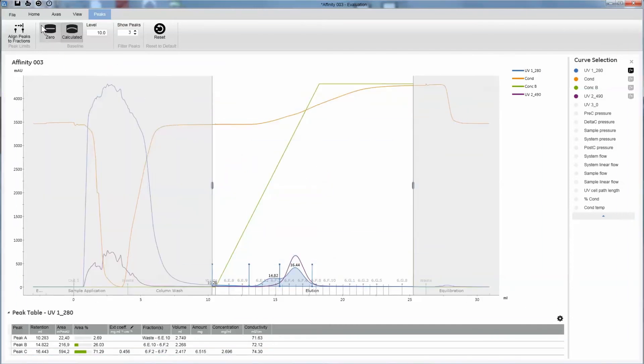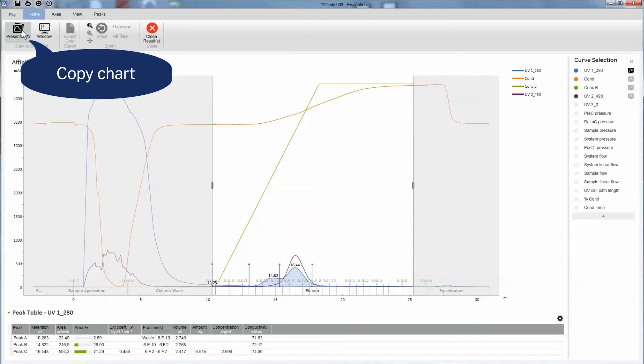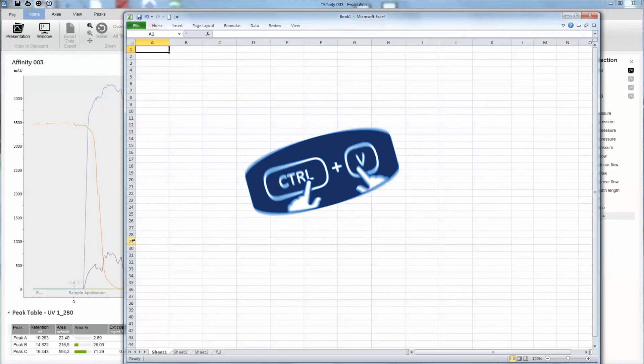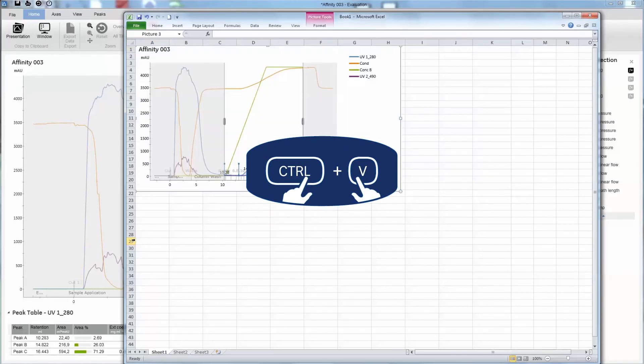Naturally, you will want to share your results. It's easy. Just copy and paste it into your application.